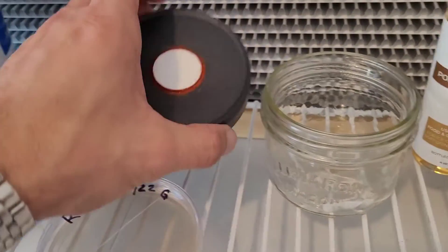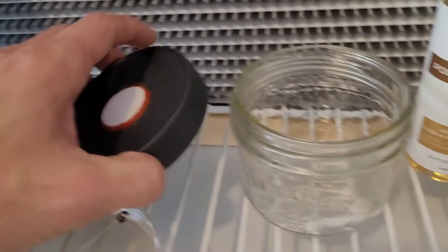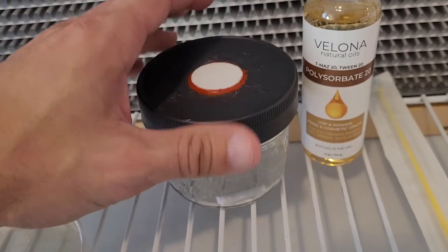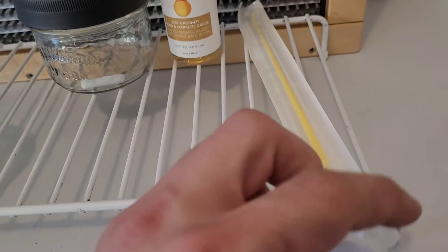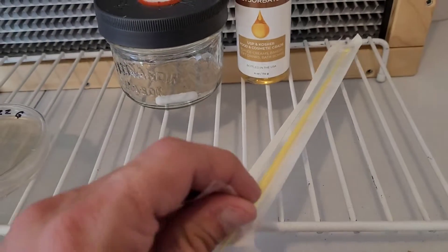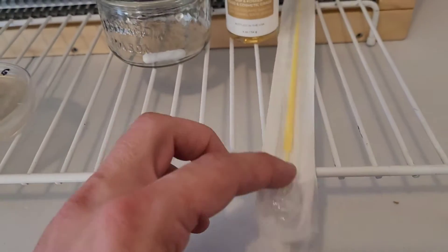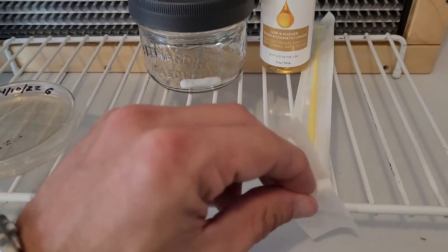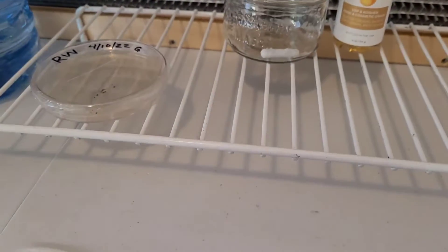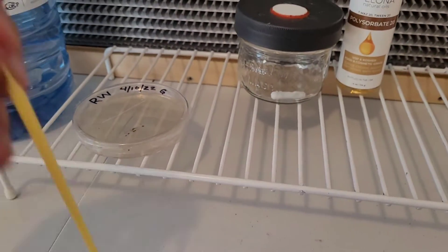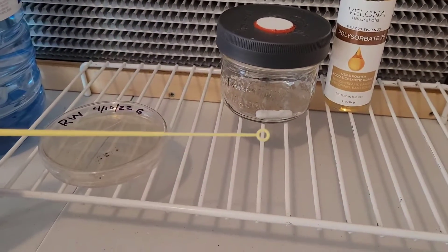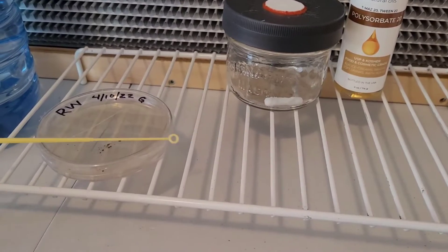As always, I'm using this ball leak-proof lid with a synthetic filter disc on top. And afterwards, once I've given about 24 hours for this to rehydrate, I'm going to be using one of these 10 microliter disposable inoculation loops for streaking new plates.